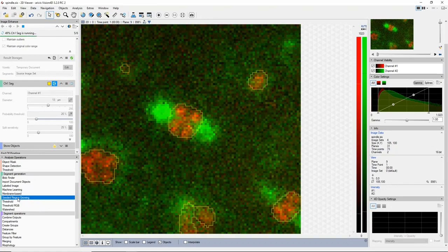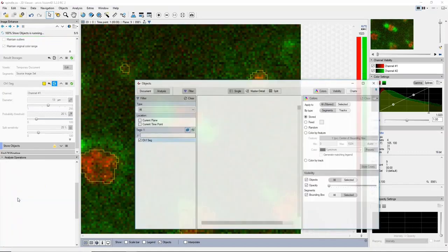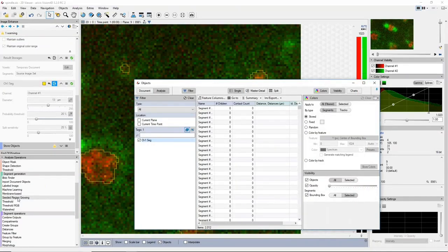But the idea is that if you are dealing with a membrane-based segmentation, if you've tried our membrane-based segmenter, you know that the results are very highly dependent on the quality of the staining. The membrane enhancement filter can help with this, but it's very time consuming.